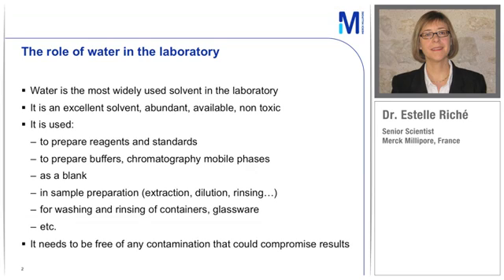The reason why we are talking about water today is because water is used in many different places in the laboratory. It is a very common reagent, and it is also probably the most abundant reagent you may use in your lab. It may be used to prepare reagents and standards, to prepare buffers and mobile phases for chromatography. It is often used as blank or in sample preparation for dilution, rinsing, or extraction. It may also be used for washing and rinsing containers.